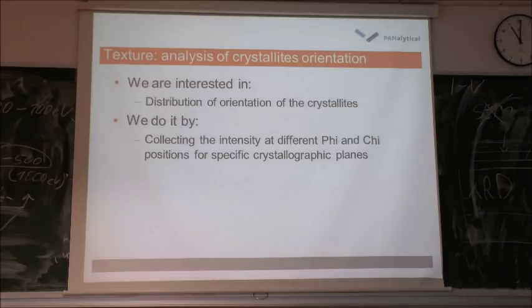Okay, then we arrived at another application. That was high resolution measurement. Then one also important application is texture. This is done more for ceramics, but also for thin films. We have some oriented ceramics with emphasized functional properties, and these properties are quite often related to texturing of samples, and this texturing can be quite nicely analyzed with this application.